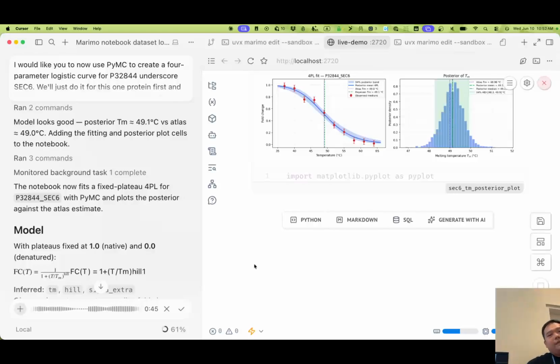And then I also, separately, want to have a diagnostic that is based on the posterior curves for anything that has really high uncertainty, because that probably meant that these things didn't melt, or they were already melted right from the beginning. And so we get a crap curve, and we have very high uncertainty. So go make this for me.